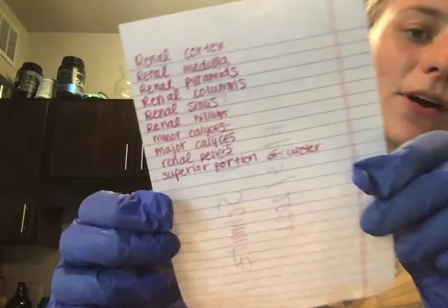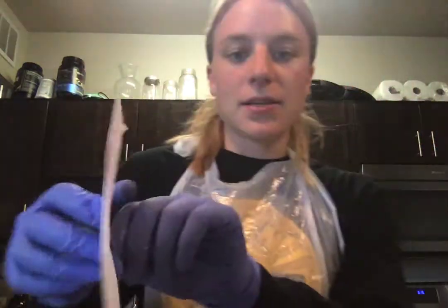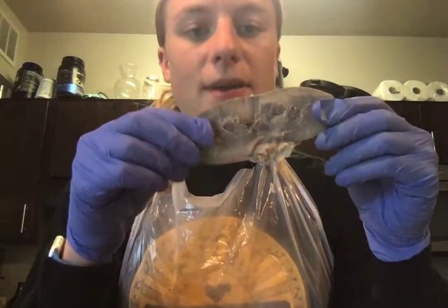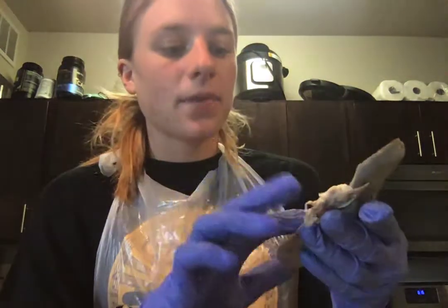On the back of my note card here, I just have my terms to follow along with for this presentation. So today I dissected a pig kidney. So we've got our kidney right here. It's cut in half so we can see the inside of it. I'm going to be going over the parts of the kidney.